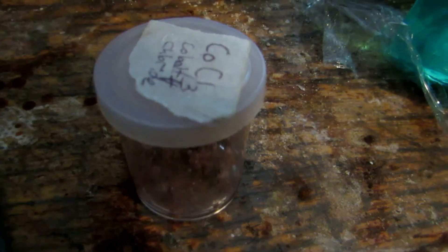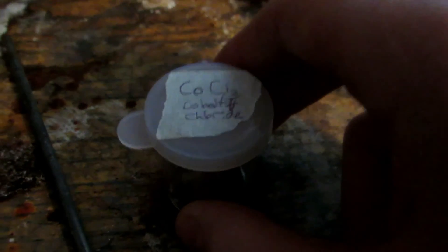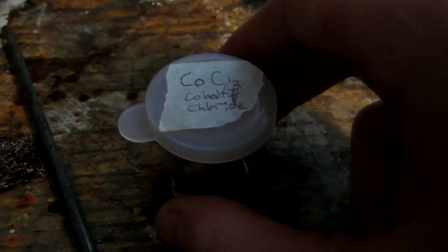Here's our final cobalt chloride. The camera makes it look brown, but it's actually a very nice purple color — quite pure cobalt chloride, to be used in the chemical garden experiment. Our yield is extremely low due to several loss factors. A much better method would be to dissolve the batteries in hydrochloric acid, then do a displacement reaction with aluminum foil, which would precipitate cobalt metal from the cobalt chloride and lithium chloride mixture.